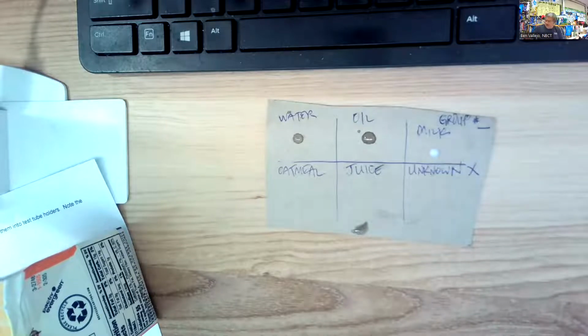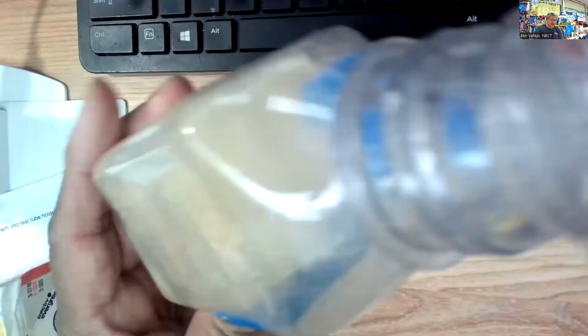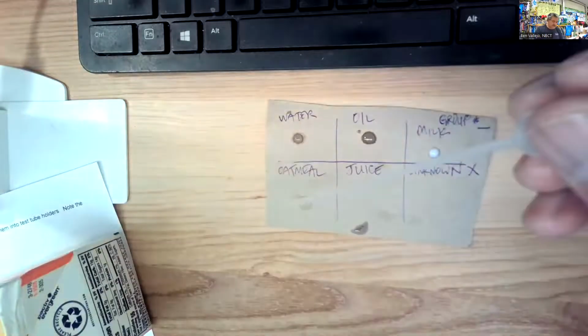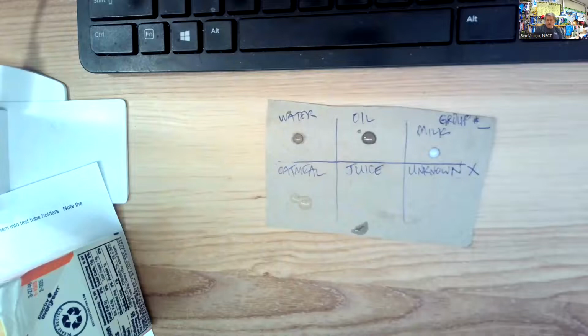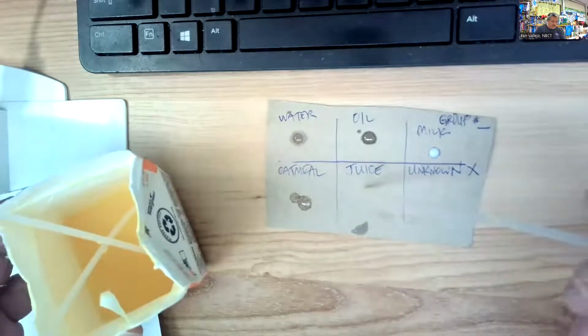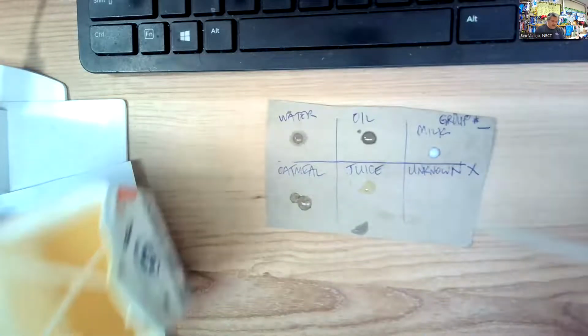Drop of milk, drop of an oatmeal solution. And we're going to try not to get the actual oatmeal, but the liquid that is in this bottle. Oops, 2 drops or 1 big drop, we're going to call it. Okay. All right. The juice, as I said, is orange juice today. So let's take a drop of orange juice and put it right there.